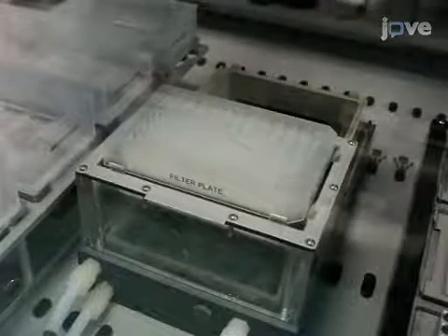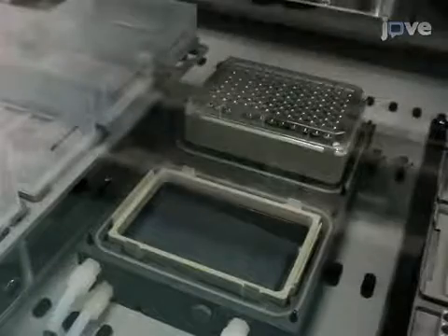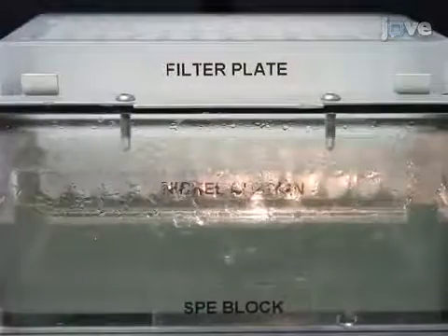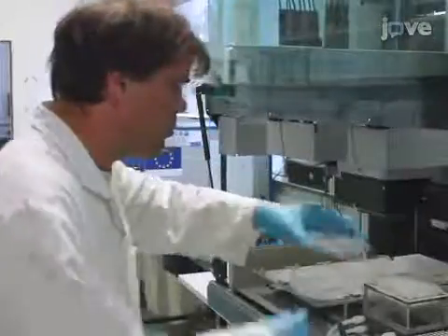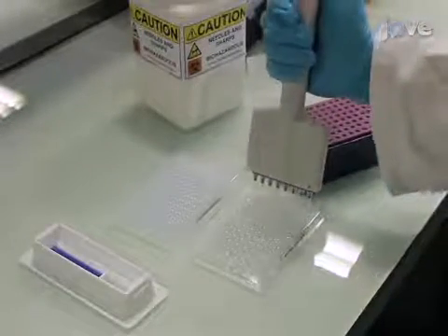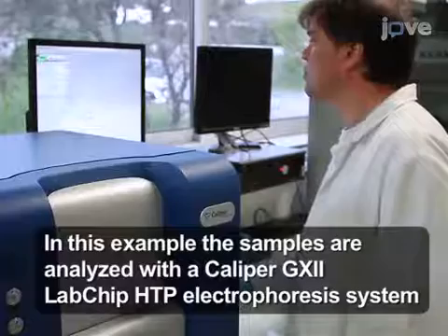After washing two more times with 800 µL of wash buffer, use the robotic gripper to transfer the microplate onto the work table and put the SPE block and filter plate back on top of the microplate to collect the elution. Then add 190 µL of elution buffer to the resin in the filter plate. After three minutes, apply the vacuum for one minute to allow all of the buffer to pass through. Quickly visually check that the elution volumes are correct. Finally, collect samples of the elution, wash, and flow-through plates for the quantification of the level of soluble expression. Analyze first the elution plate, and only when necessary, check the relevant wash and flow-through fractions.